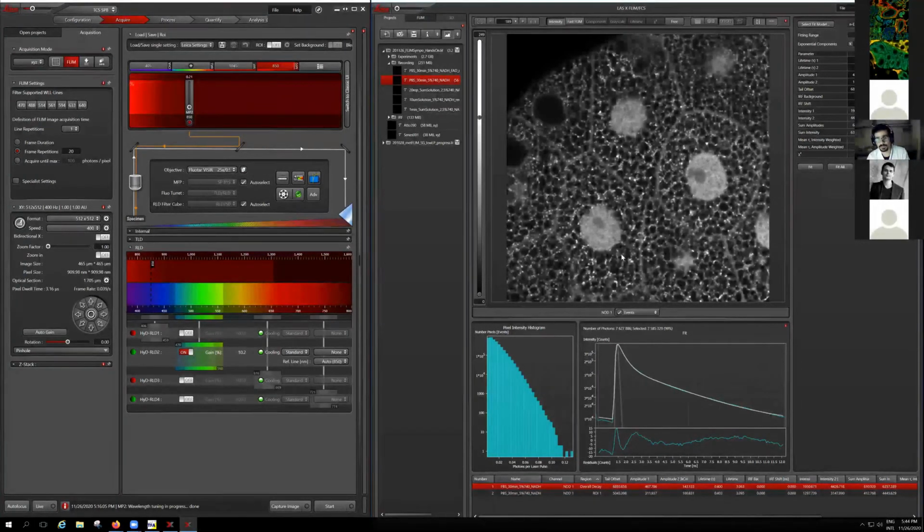It's not from a single pixel. So I have not done pixel-wise fitting yet. This is what I have to emphasize again. What I'm doing here is just looking at the whole image to find out what is a good strategy for the fitting later on.